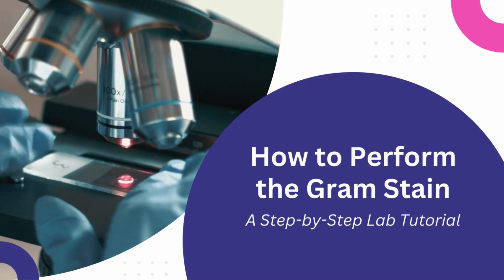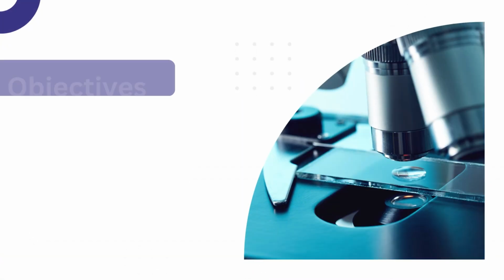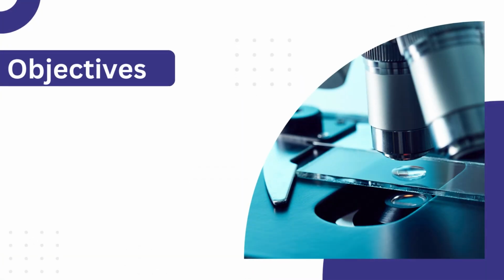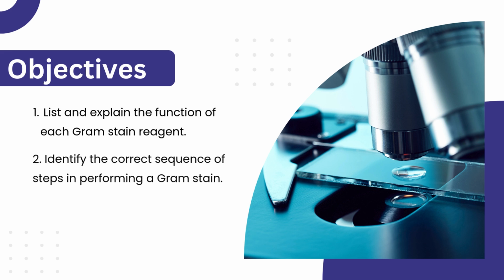Hi everyone! Today I'm going to show you how to perform the gram stain through a step-by-step lab tutorial. Before we begin, let's review what you should be able to do after watching this video. By the end of this video and lesson, you should be able to explain the function of each gram stain reagent, as well as identify the correct sequence of performing the gram stain.